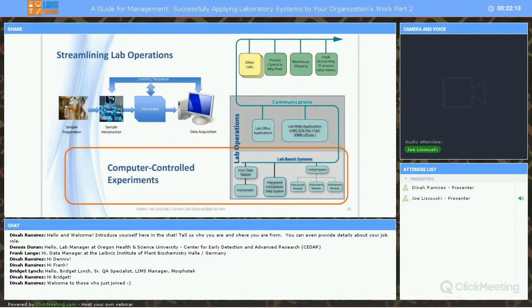Robotics for sample preparation is another area where gains can be made once the engineering for process changes is done and the resulting system is thoroughly evaluated. This has been particularly effective in life sciences applications where microplates can be used for sample handling. The same equipment can and should be usable in other application areas and industries.